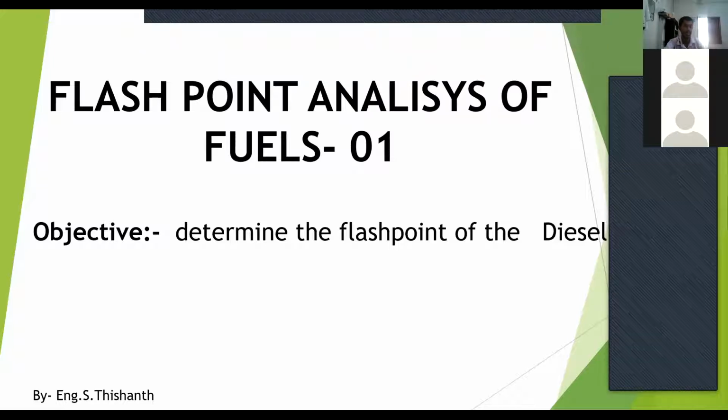It can pass that flashpoint temperature at any time without us knowing, and then it can burn or blast. So it is very important to find out the flashpoint of any flammable fuels or oils. In the second session, we will go deeply into the applications and safety procedures regarding flashpoint analysis.